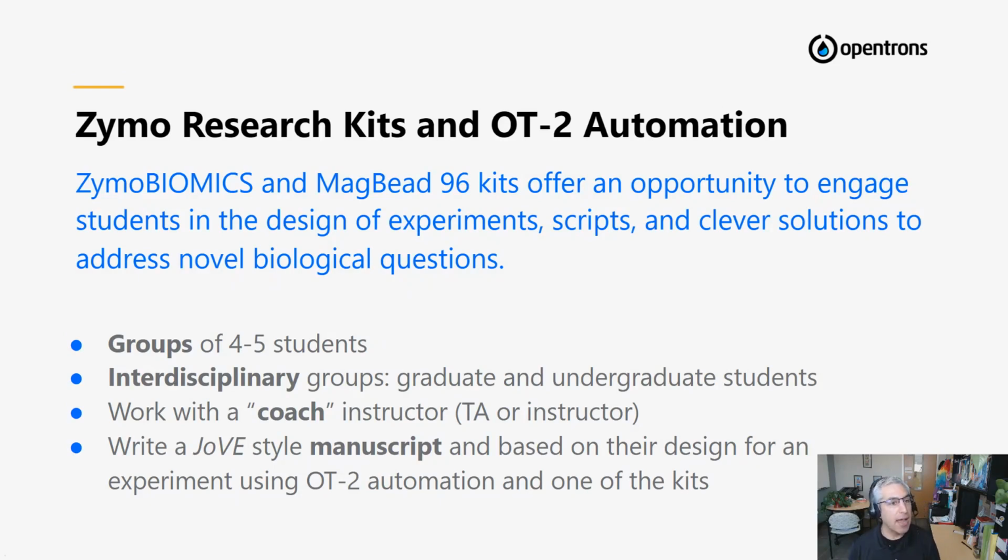We were lucky to have 2 or 3 instructors, so a postdoctoral scholar, myself, and a graduate TA, and we each took on the task of being a coach for a group of 4 or 5 students. And what we decided was to do a JoVE Journal of Visualized Experimentation style manuscript based on the design of an experiment using the OT2 and one of the kits.